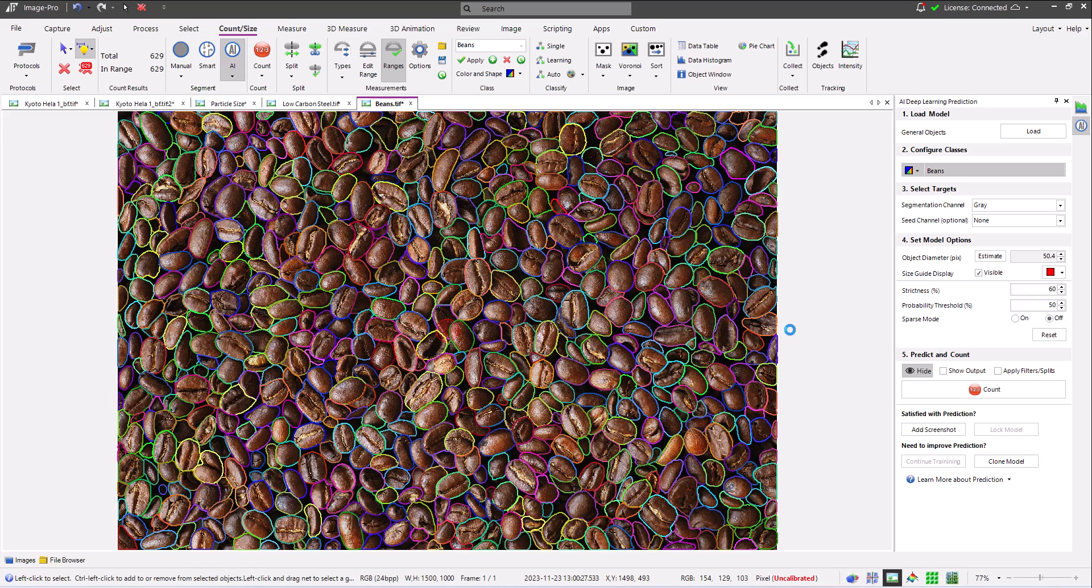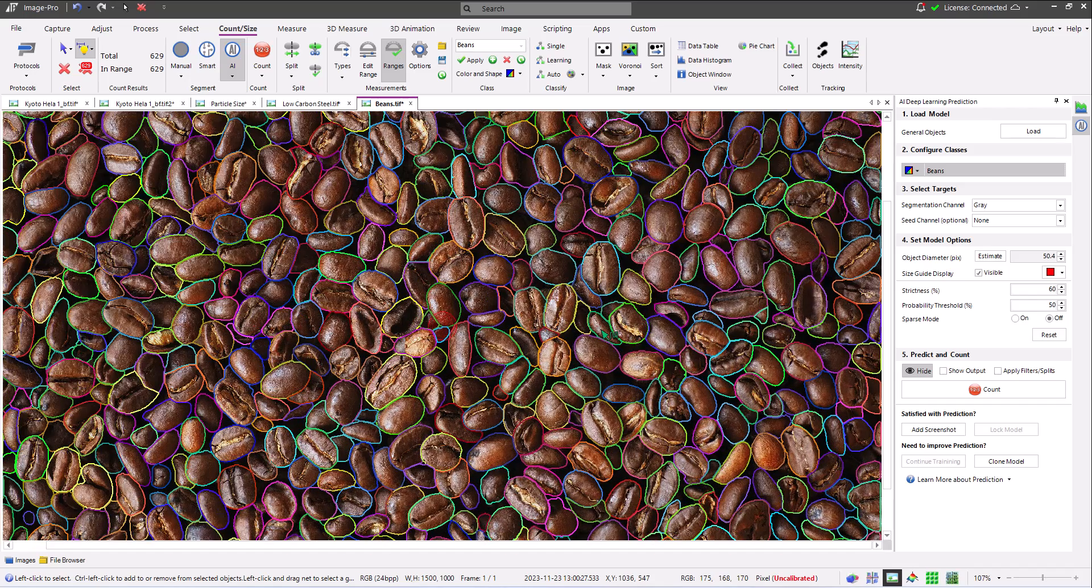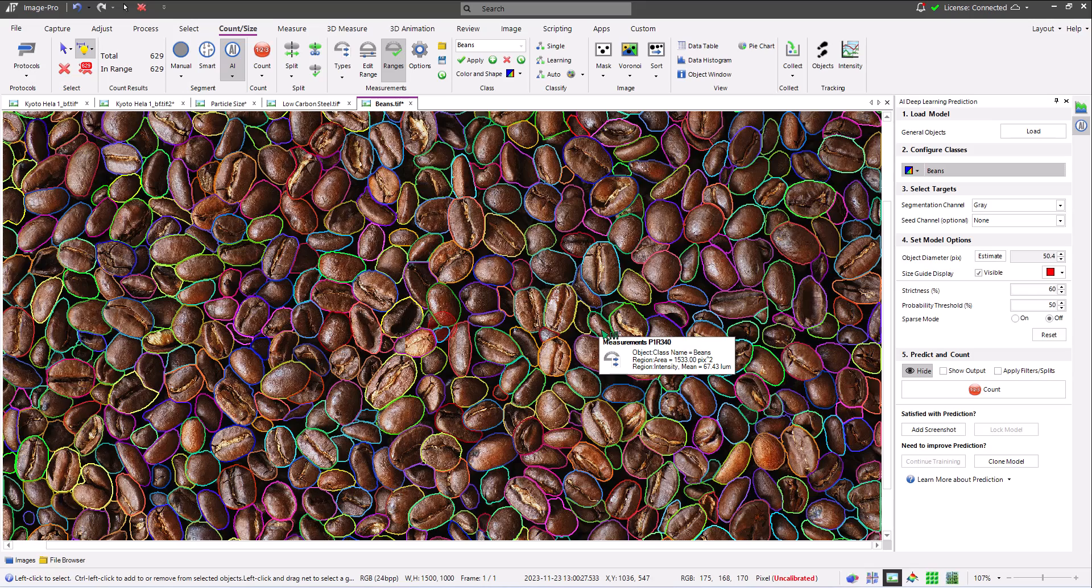Here we can see how well the model does at identifying individual beans in the image, regardless of their orientation, completeness, or unusual illumination.